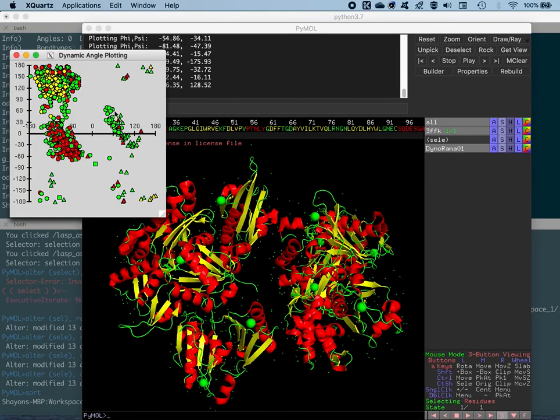You have some of the normal amino acid residues apart from the glycine and proline colored in green as well. So that means they belong to the loop region. They can belong to the loop region, that's fine. And then you have the proline residues. In fact, all of them belonging to the loop region, which is fascinating. And then you have this guy that we showed just there while annotating it by right-clicking it. We found that it belonged to the beta sheet region. And this is kind of a confirmation that this residue indeed is belonging to the beta sheet region.